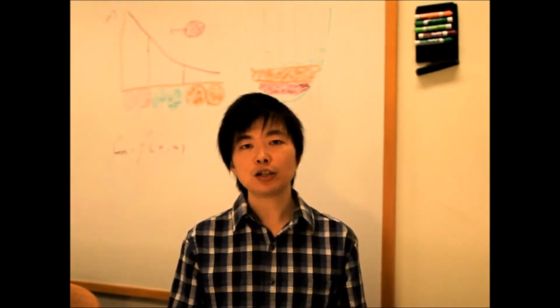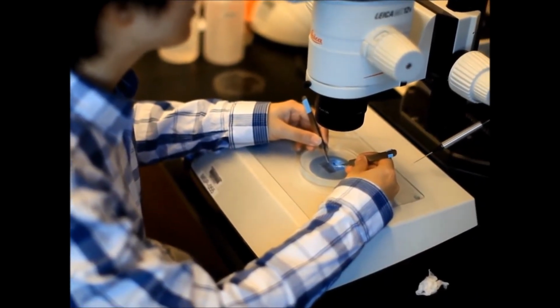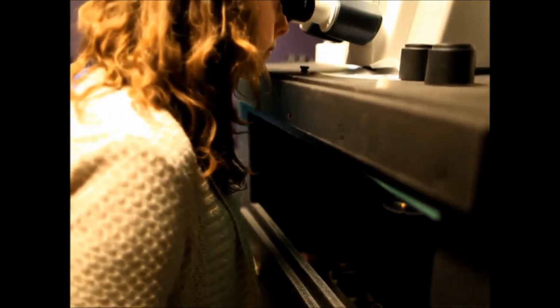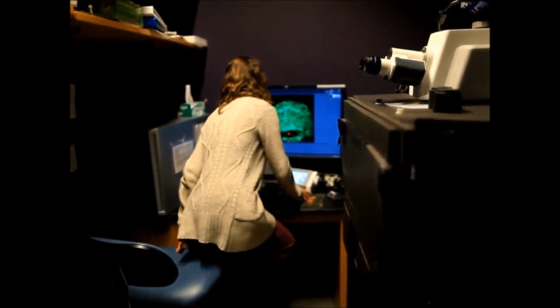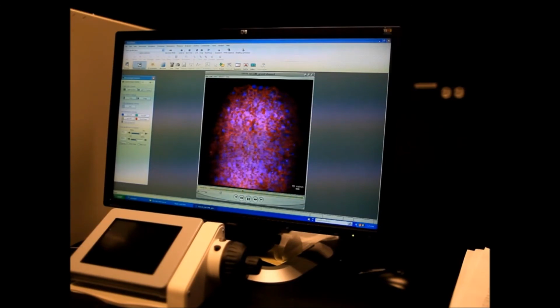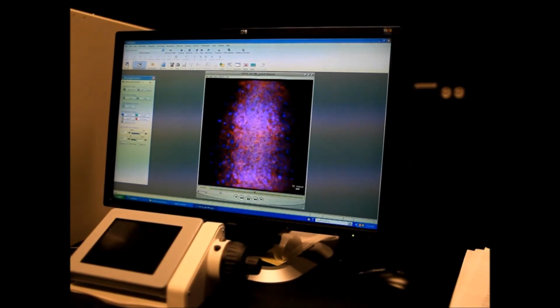This is a very challenging task, because during this time, the embryo undergoes drastic morphological changes, making continuous imaging on the same cells very difficult. It took us a lot of time and hard work to get everything working on the imaging, but then we started getting the desired movies. It all happens in front of your eyes. The cells move, divide, change shapes, and express different genes. In moments, a patterned neural tube takes shape.